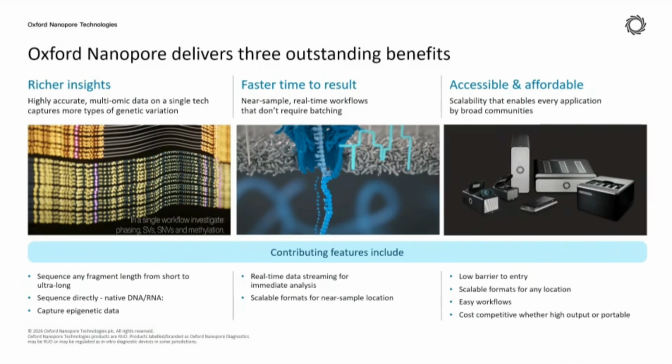It can also sequence DNA or RNA molecules directly. The good point about this is that we are able to detect methylation, or epigenetic variations, inside our samples. If there are any methylated C or methylated A in the DNA molecules, then from native sequencing we are able to detect the methylated bases. From there, we can directly get the DNA sequence together with the epigenetic information.